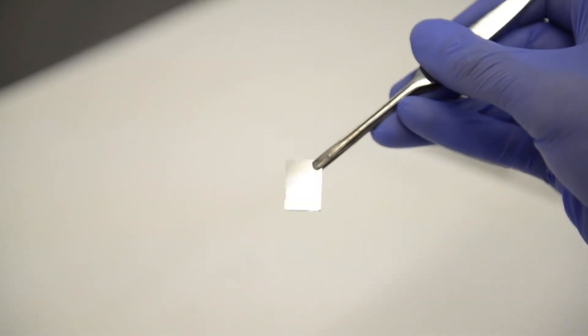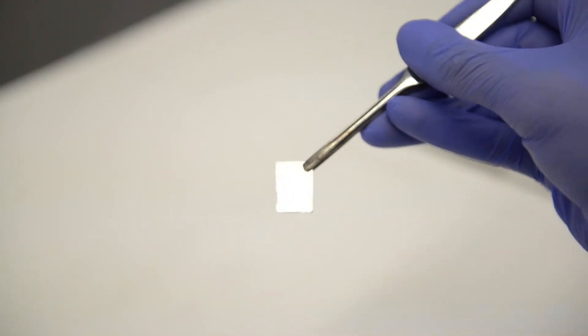Perovskite solar cell is really the more promising third generation solar cell technology that is coming up now. And we just wanted to show students how easy it is, how simple it is.